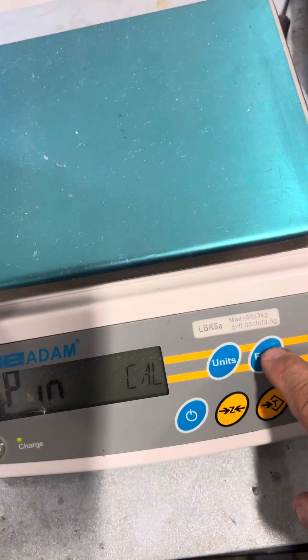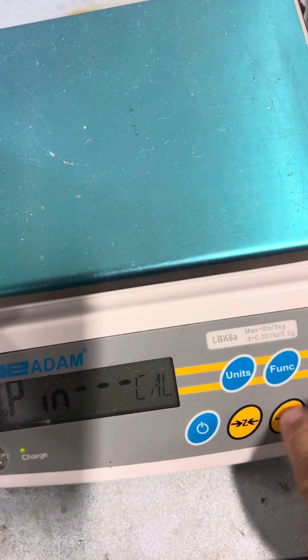It asks for a pin. Press function, then units, tear, zero.